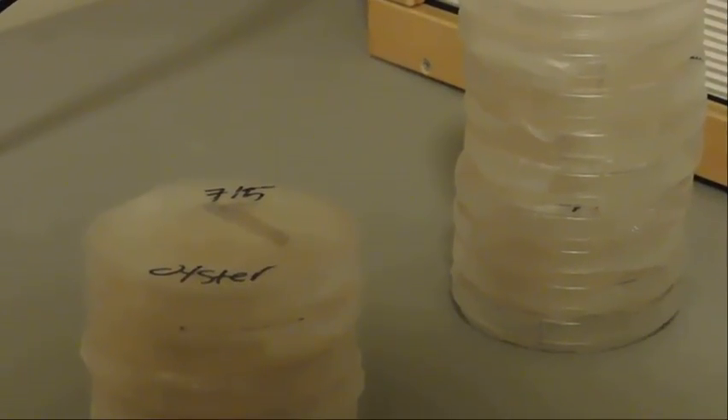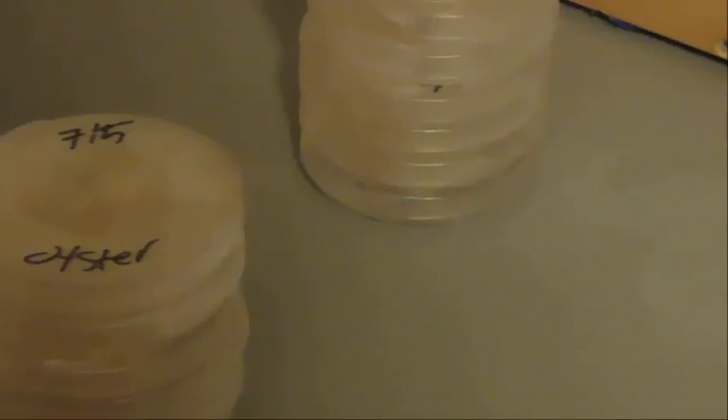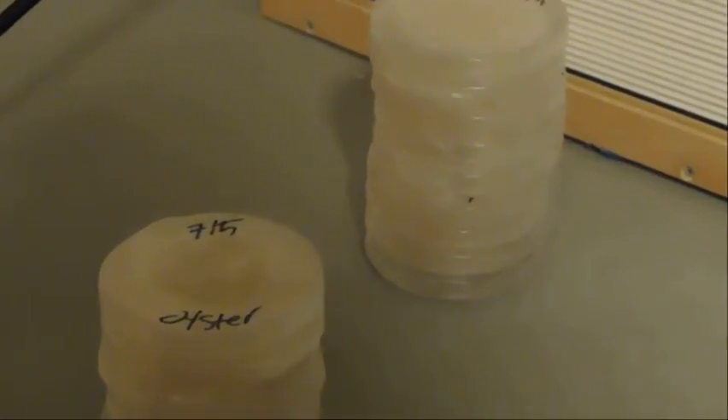This is the final product. Grab it, stretch it, and wrap it around. Wrap it up and don't forget to label what brand, what strain, the date — all that good stuff. Make sure you check the description for all the pricings and all the tools you need.